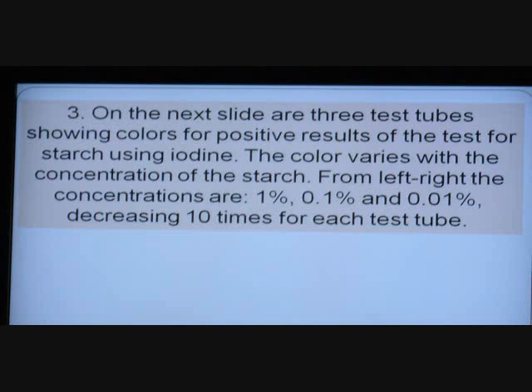So I'm going to show you how this thing, it ain't always flat black. It has shades, which is kind of nice. And that's just 1% solution. That ain't a lot of starch either, buddy. And if you can detect 1/100th, this is a pretty good stain. And you'll soon see the colors, and they're not hard to figure out which is which. But I do like that people do it too. Let me show them to you.